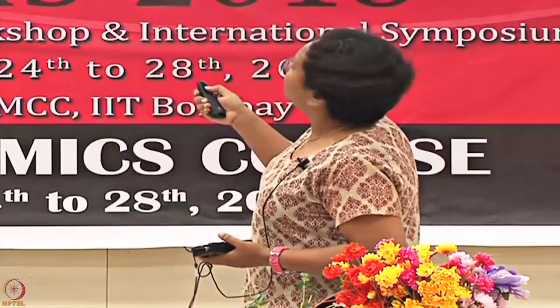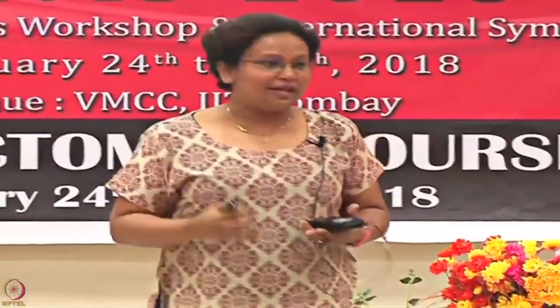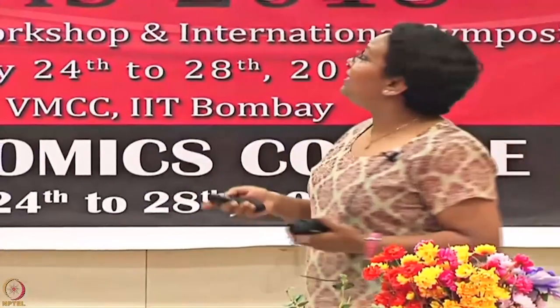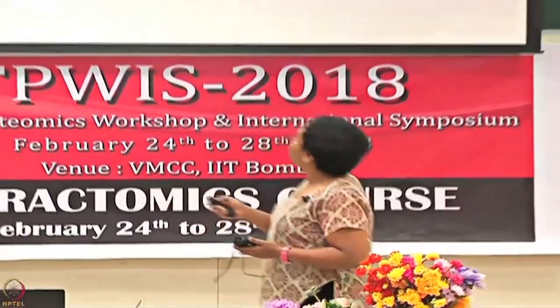You go to something like, I can't even see, 10,000 RUs, which is an extremely huge amount of RUs. You don't need that much protein. If you are reaching around 4,000 or 3,000, it's more than enough for any of the applications that we are talking about. So we actually did not get enough information from there. So we took the same thing and we ran it through the whole immobilization process.